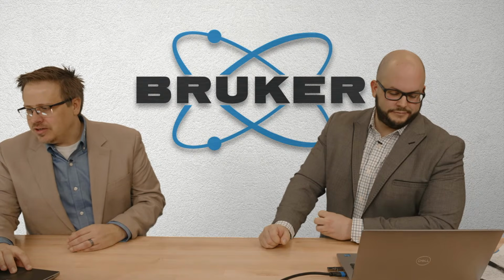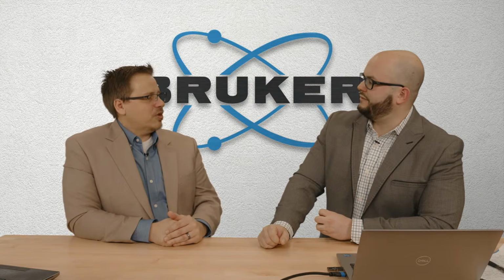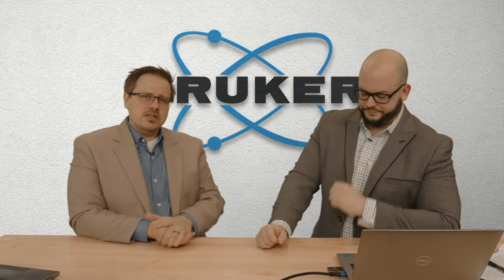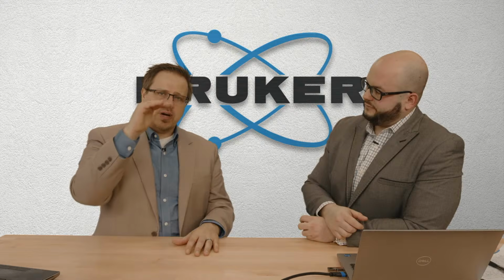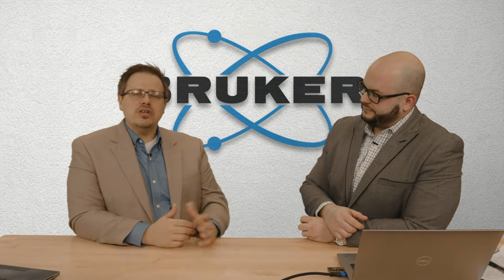All right, is Bragg 2D in Lynx Eye available for the analysis of residual stress? Lynx Eye and Bragg 2D. So yeah, Bragg 2D, no, you're not going to get a benefit from it because you're going to have to scan. Where Bragg 2D comes in is it's really good for assessing, say, the sample preparation quality. If it's spotty Debye rings versus not spotty. Also, if you have some orientation, it can help to identify those issues.